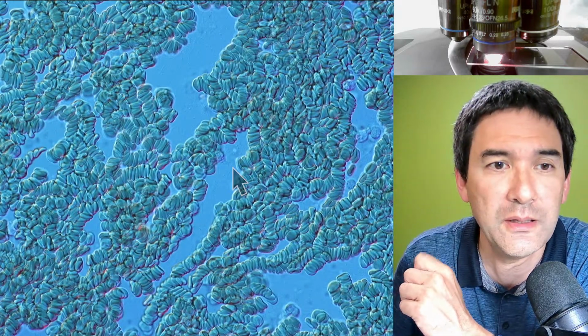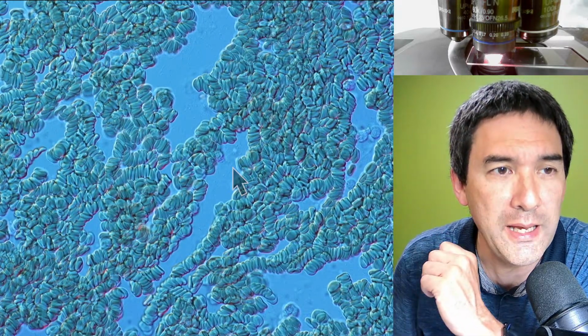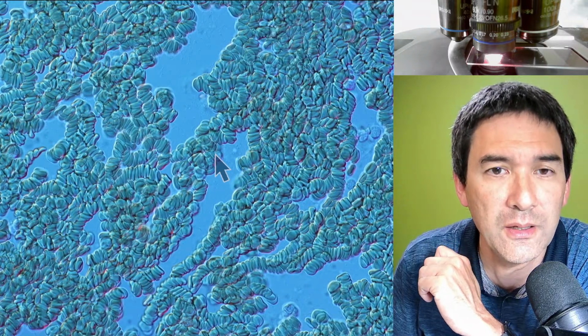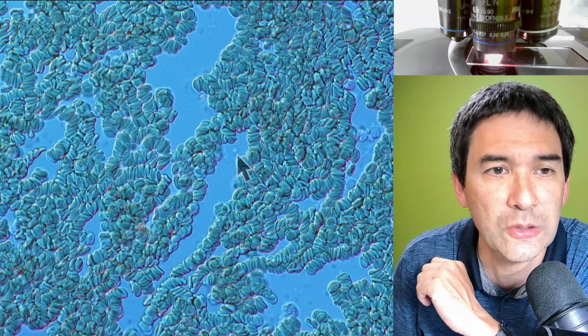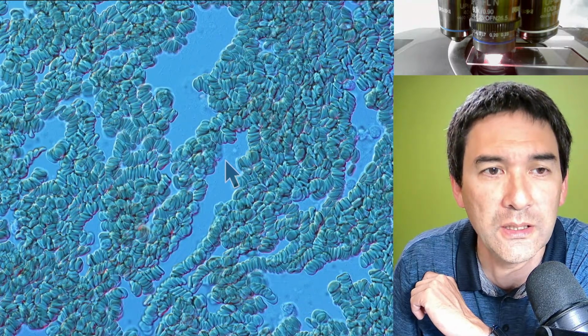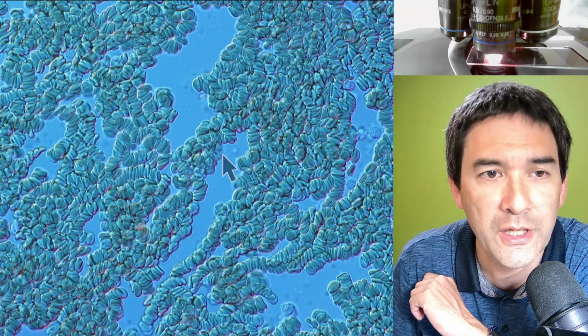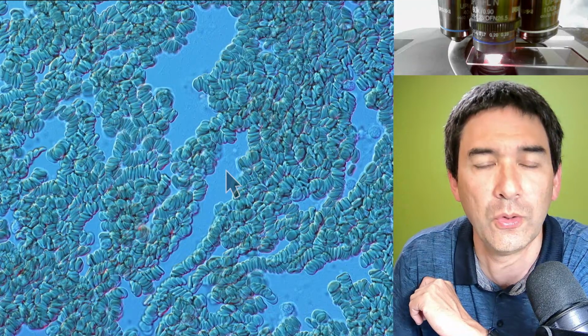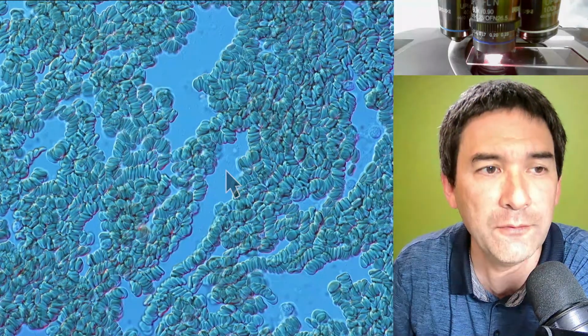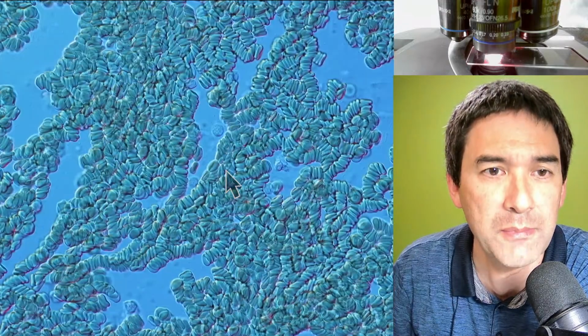If you're really patient, you're able to see those, and you can see that they are moving sometimes very slowly. For this reason, if you find one, you have to really look at it for a couple of minutes. And now as you see, it's gone; it probably disappeared somewhere over there with the other red blood cells. But I'm going to show you a high-magnification time lapse that I made.